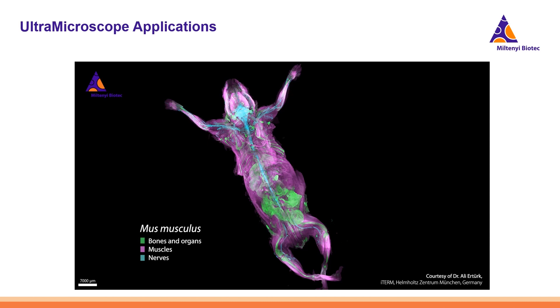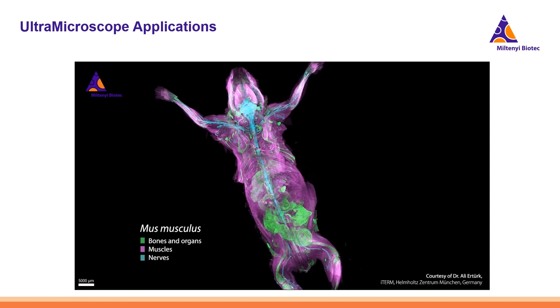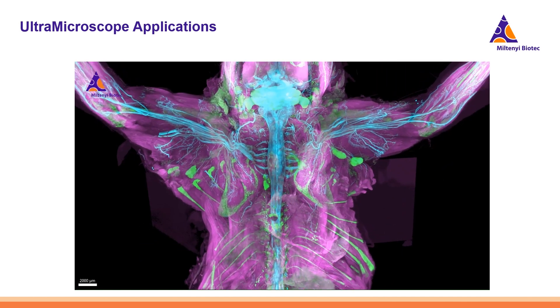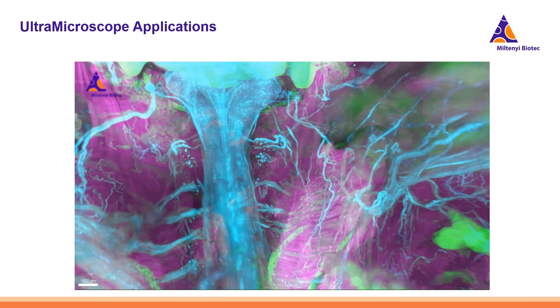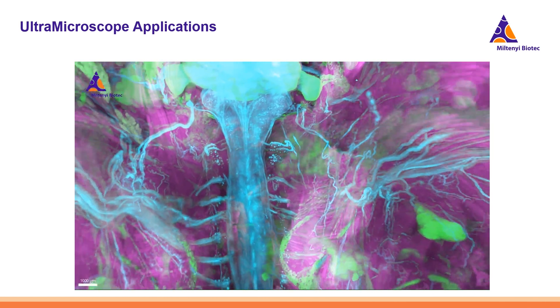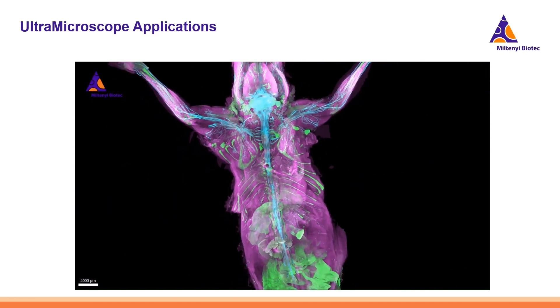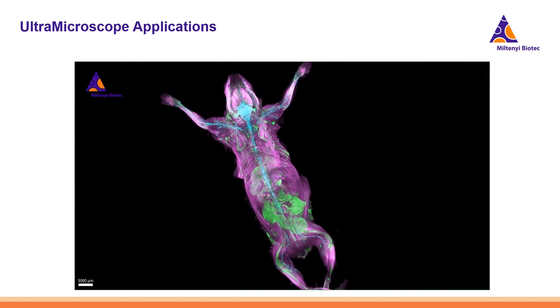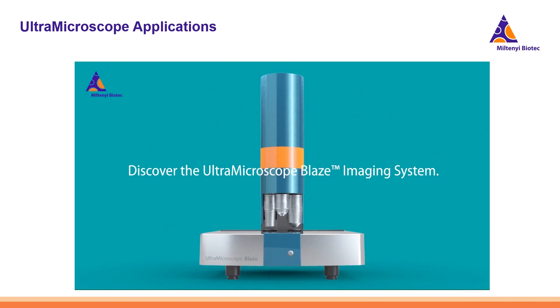Here is another compelling final example of a 3D image obtained using the Ultra Microscope, again from Dr. Ali Ertürk's lab. The rendered image stack effectively produces a captivating 3D visualization. To highlight different structures, fluorescent antibodies were used to stain the bones in green, muscles in violet, and nerves in teal color — showcasing what one can achieve using the light sheet microscope, particularly the Ultra Microscope Blaze.